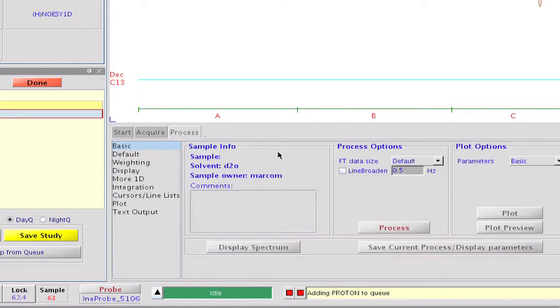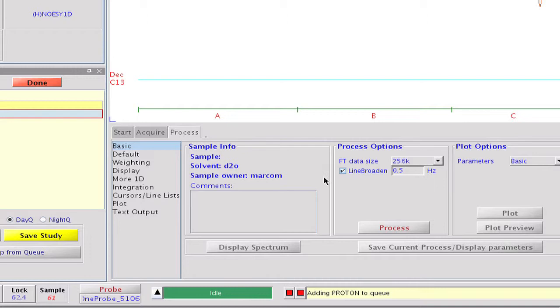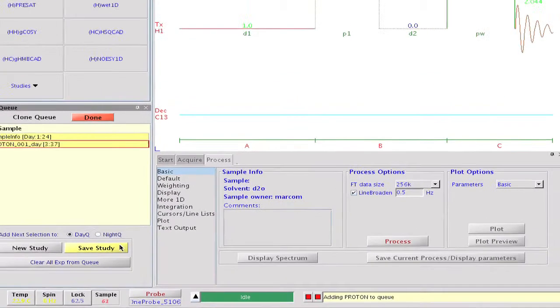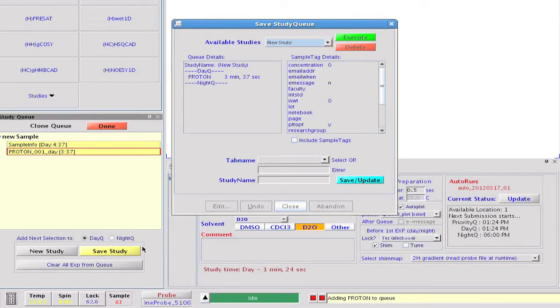and apply a little line broadening, say half a hertz to the data before processing. We'll use the save button to save those changes.